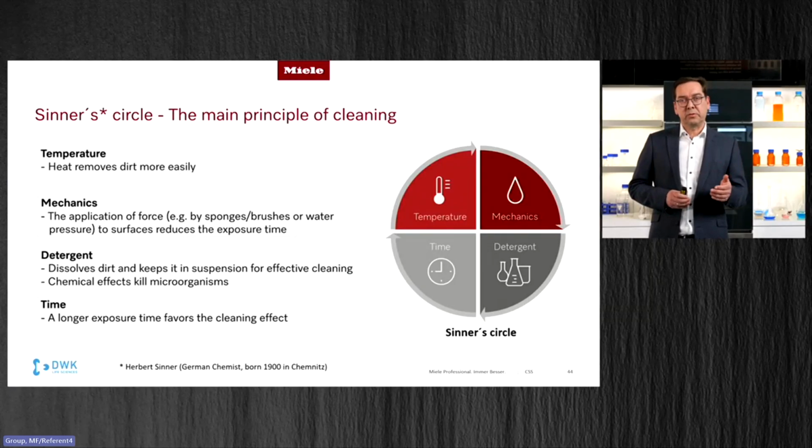But that would mean that to achieve the same cleaning result, you have to either extend the mechanics, so that means adding more force, more water pressure, for example. You can also use a more aggressive detergent or a higher concentration of detergent, or you have to accept a longer exposure time to come to the same level of cleanliness. So whatever you do, please bear in mind these four factors.